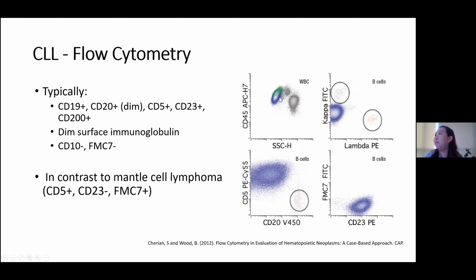So we're looking at the blue population here that's expressing bright CD45 and low side scatter, because they're lymphocytes. They're supposed to be low side scatter because they're very simple. They're not like neutrophils where they're very complex. Remember that side scatter reflects your cell complexity.